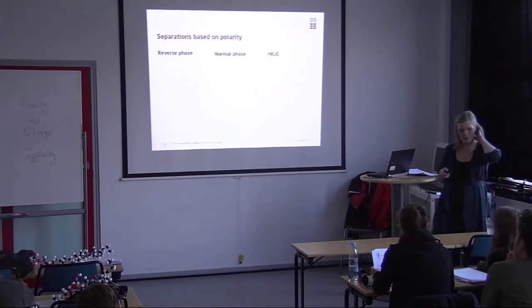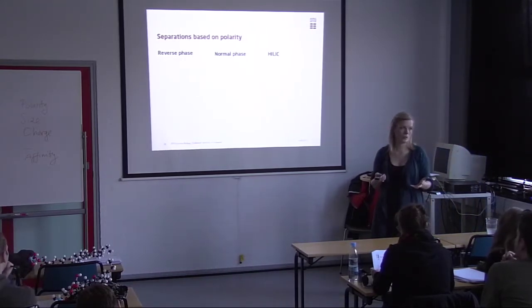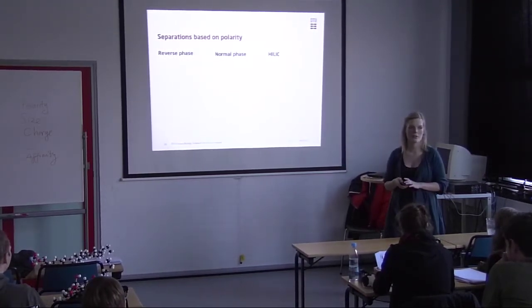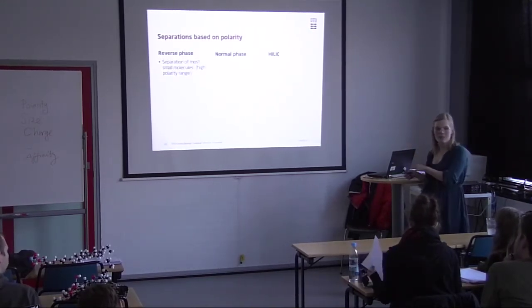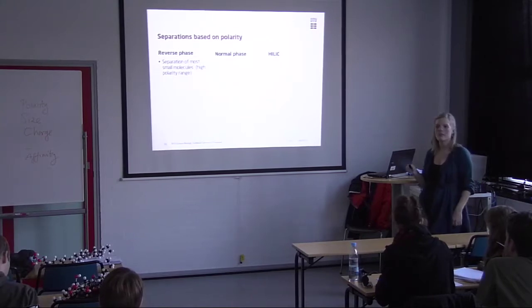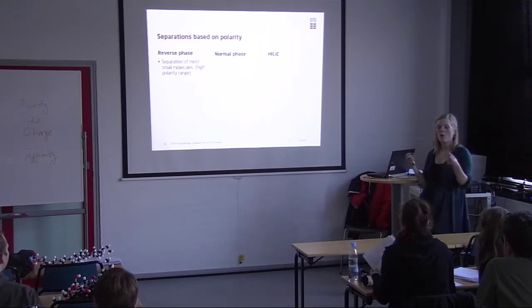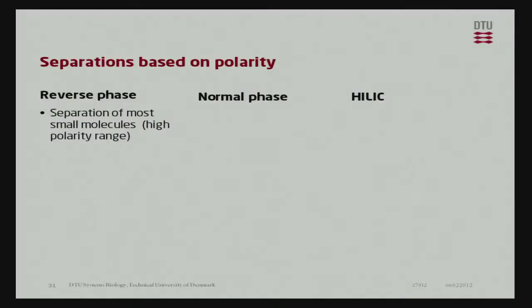So when we're talking about separations based on polarity, we got three separation principles, or three types of chromatography you're going to learn about. Reverse phase, normal phase, and HILIC, hydrophilic interaction chromatography. And they're good for different types of compounds. So we got the scale before. Reverse phase is a very versatile method. It has a very high polarity range, so it can hold on to quite polar compounds and is able to separate very apolar compounds as well. So this is a really good starting point.